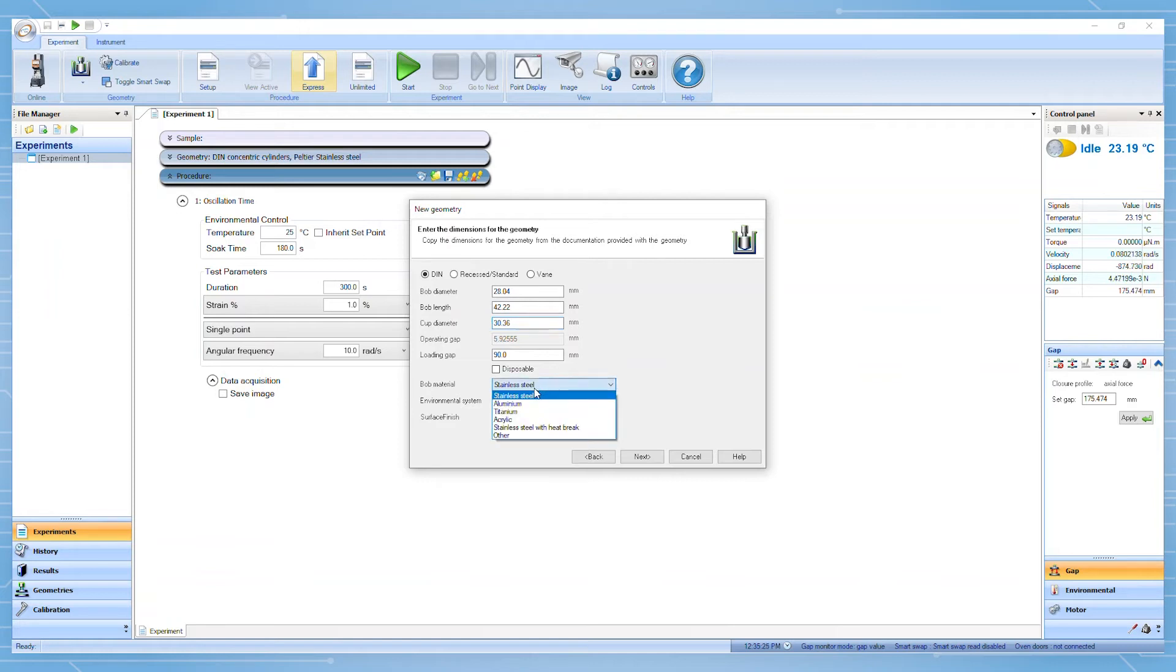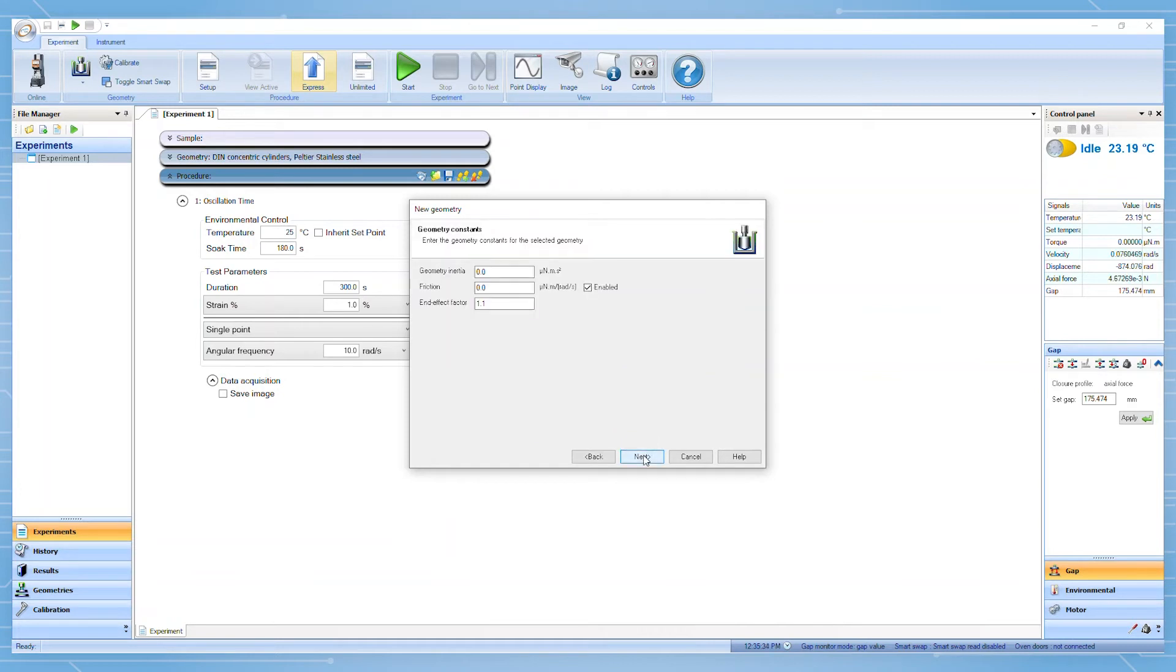Exact geometry specifications will depend on the rotor, such as the DIN, recessed, or vane, and the cup, such as a traditional cup or the double wall cup.